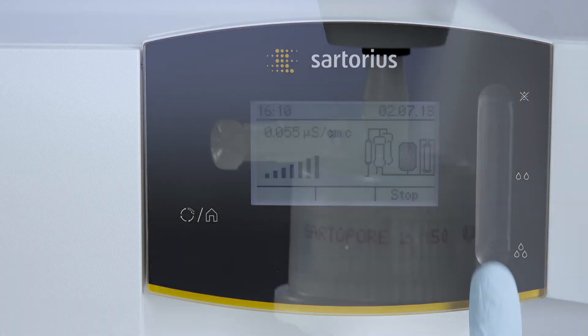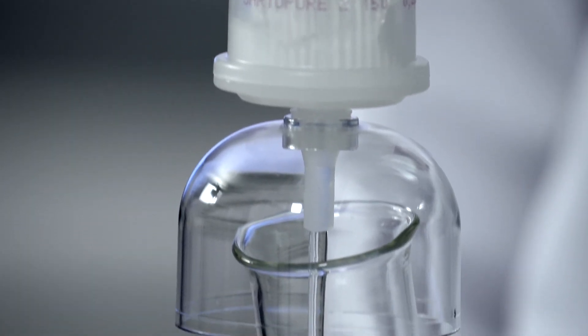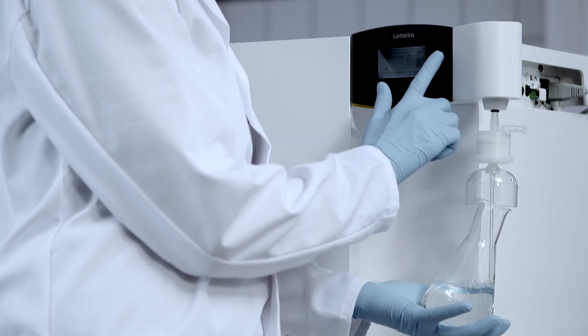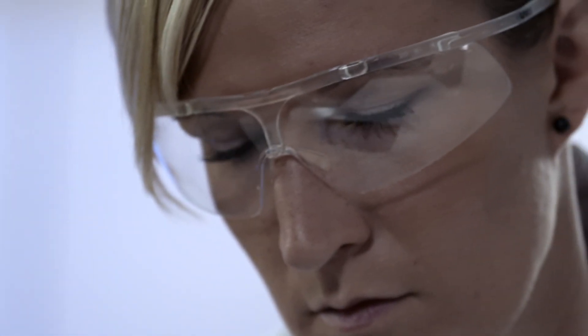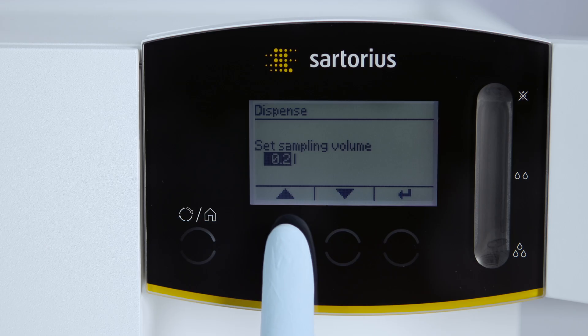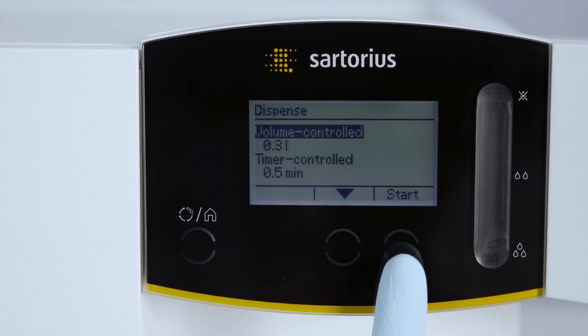The water can be dispensed in several different ways. You decide how the purified water should be dispensed — manually with only one hand, or volume and time controlled. Simply enter the necessary volume in the menu, and the system will dispense it.